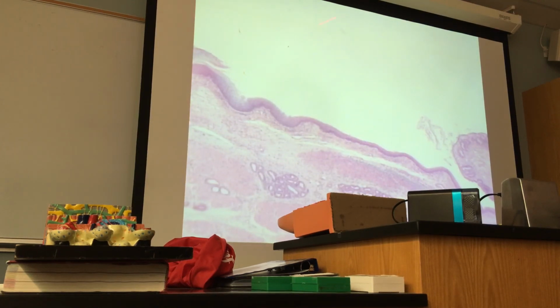So what happens? You can see some layers are sloughed off, some cells. So in microscopic examination of stool, the epithelial cells are present. Then you will see all those squamous cells, flat cells, that are sloughed off as a result of abrasion and friction. Okay? Make sense?